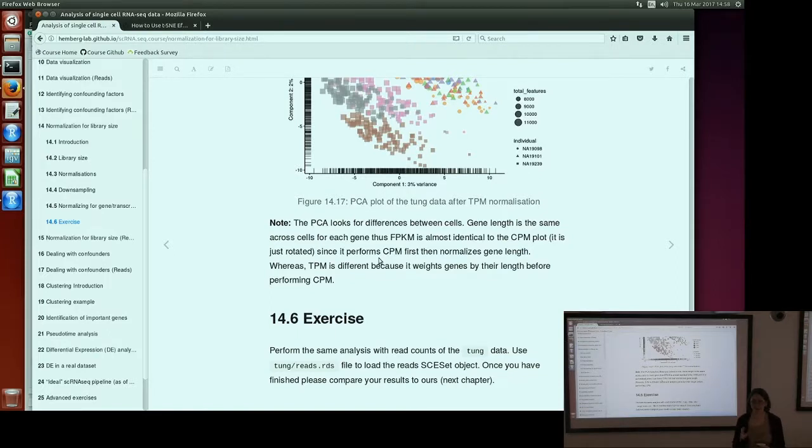Yeah, in bulk RNA, definitely you should be. But if you're doing full-length single cell, full-length single cell often isn't really full-length. Often, it's been shown that the reverse transcription is not as efficient, and you're only getting up to a maximum of sort of 3 kilobases of each transcript. So genes that are bigger than 3 kilobases long, you'll actually be over-normalizing if you apply these methods.